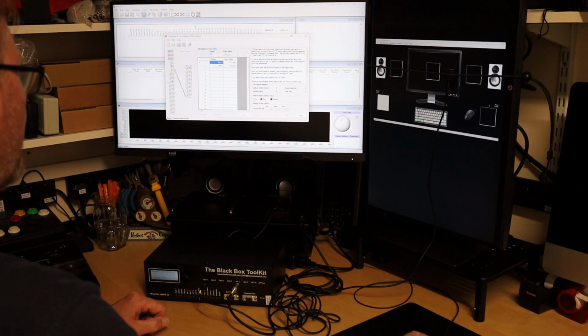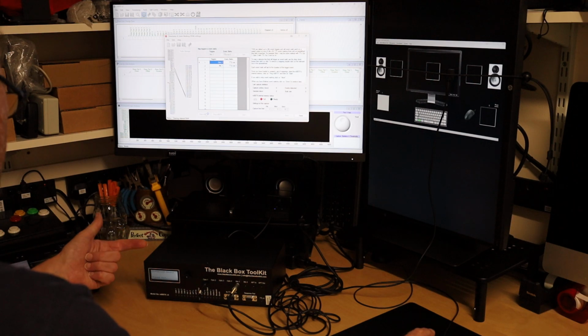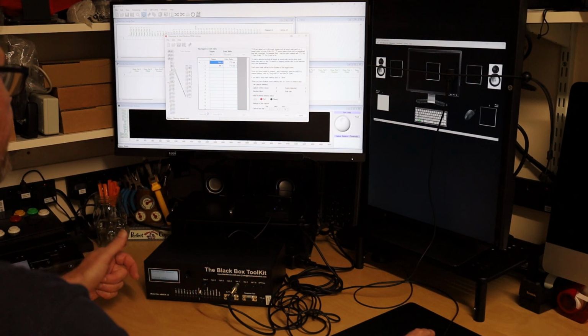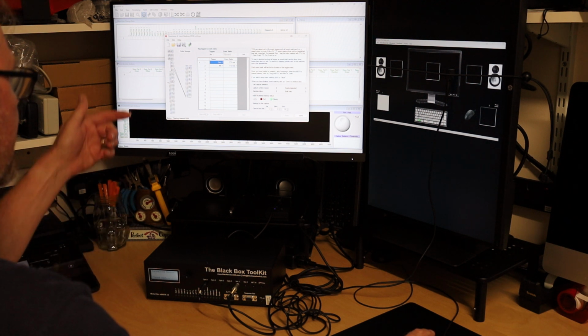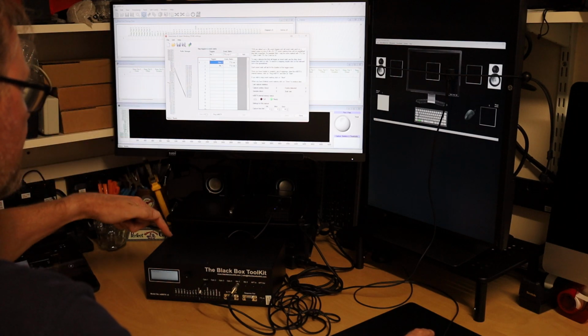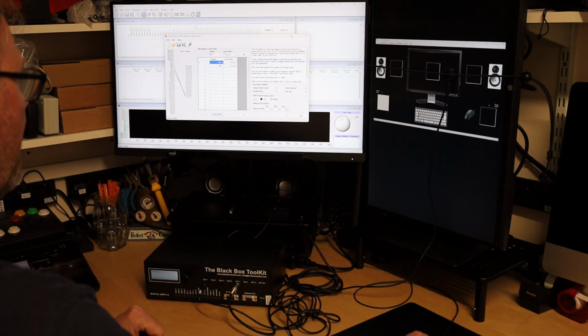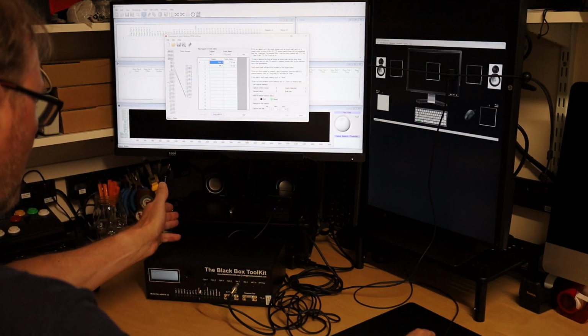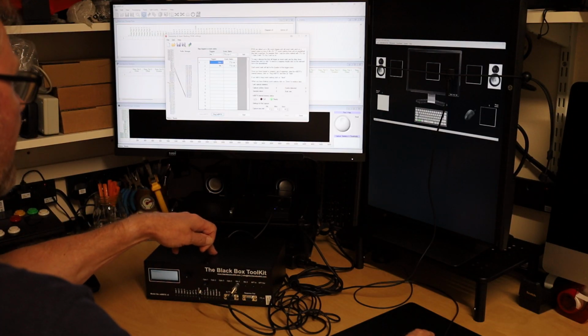What we do before we start as well, we clear the Blackbox Toolkit RAM, which is internal. After you've formatted it for the first time, it's a lot quicker on subsequent times. The other thing you can do as well, you can download any of these event marking profiles to the box, and you can run it off the PC. So you don't have to be linked to the PC to run the profiles. At the moment, I'm going to program the black box. It's all gone across into here. So once we say go, it'll run independently and do the event marks.